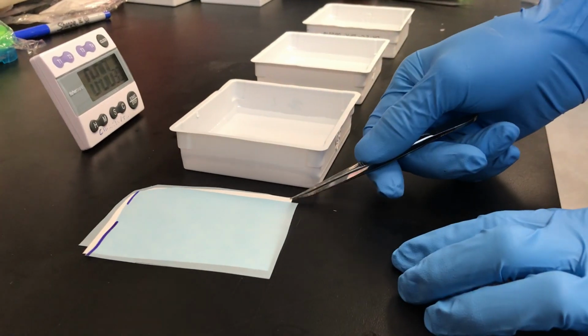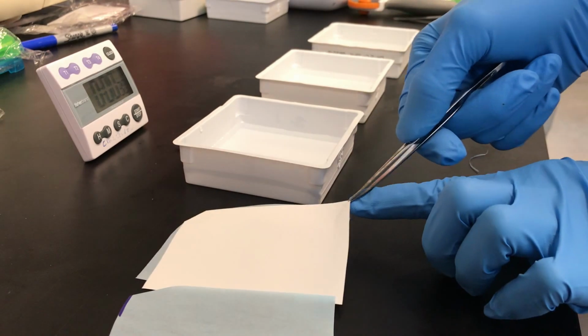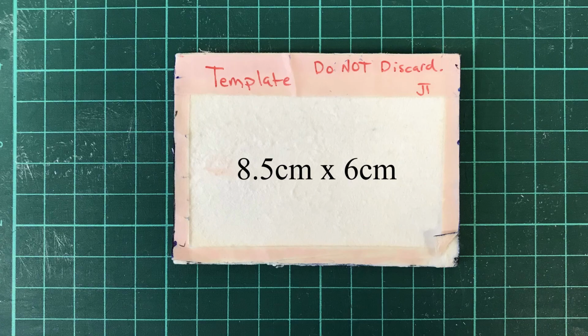In order to make the proteins accessible to antibody detection, they must be transferred from the gel onto a membrane. Cut a polyvinylidene fluoride membrane, or PVDF, to fit the measurements of the gel. Every interaction with the membrane should be handled carefully with a rounded tweezer to avoid puncturing the surface, and always hold the edge of the membrane.